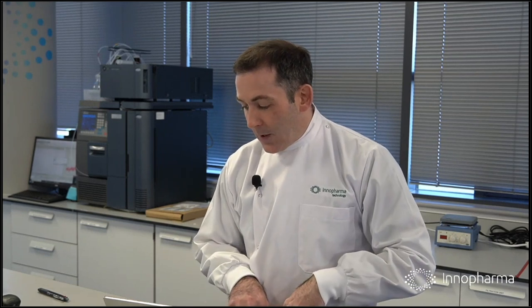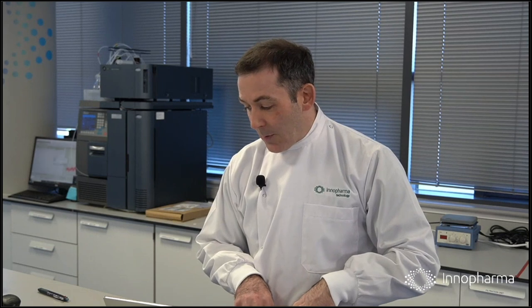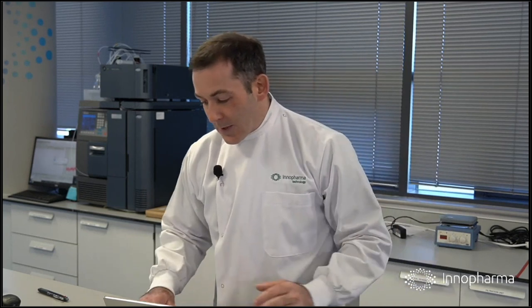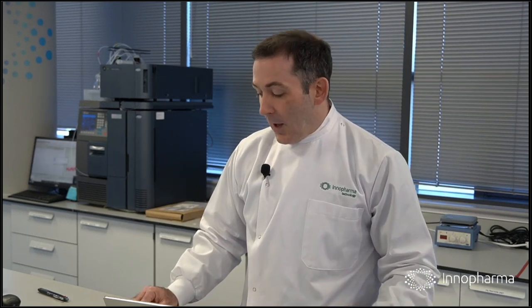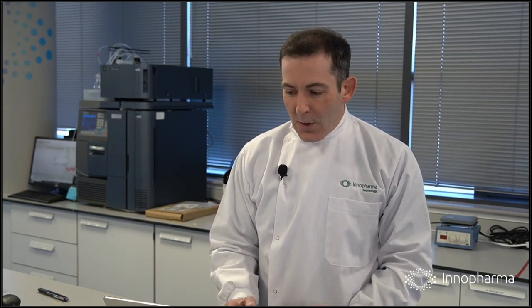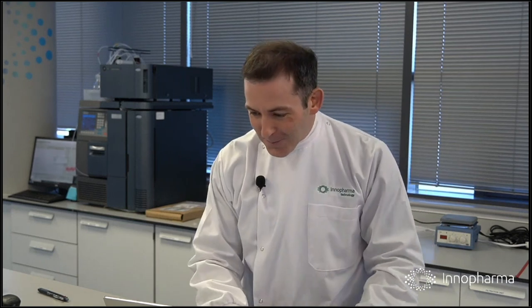And the calculated yield. When we compare this 23.5 grams to what we expect to remain in the solution, which is in fact 25.6 grams, that means our yield was approximately 91%, with other losses being accounted for by what remains in the reaction vessel, as we saw. So very close indeed, but you saw exactly how laborious and arduous and time consuming that process was. So I hope we've justified the requirement and the use case for process analytical technology where you can measure these things in real time in the process, or near to real time, in line in the process.